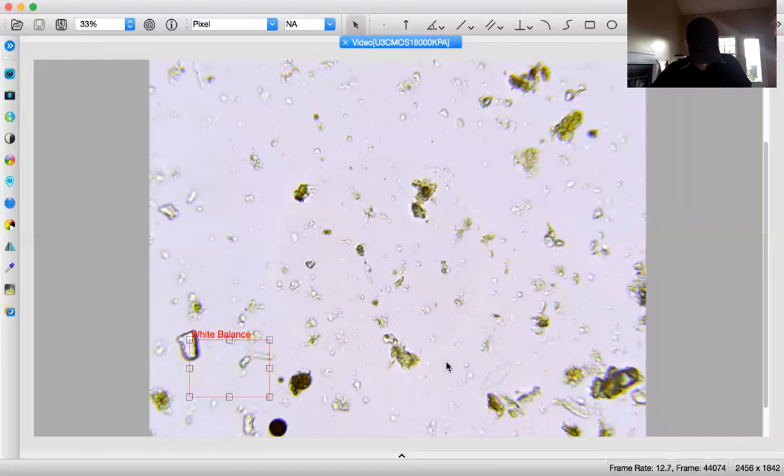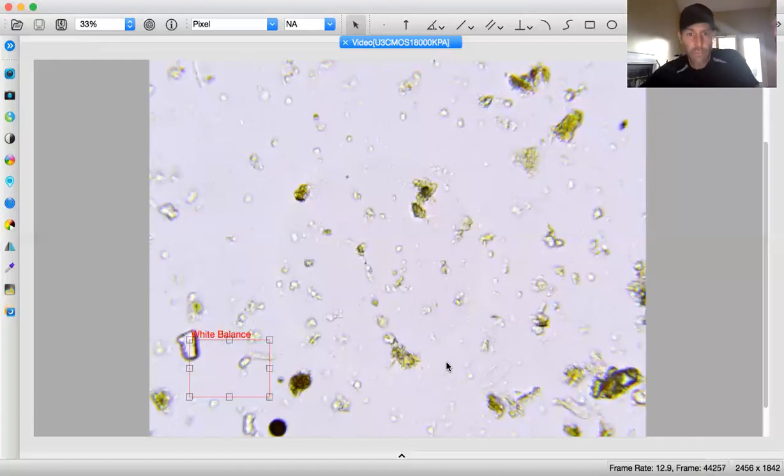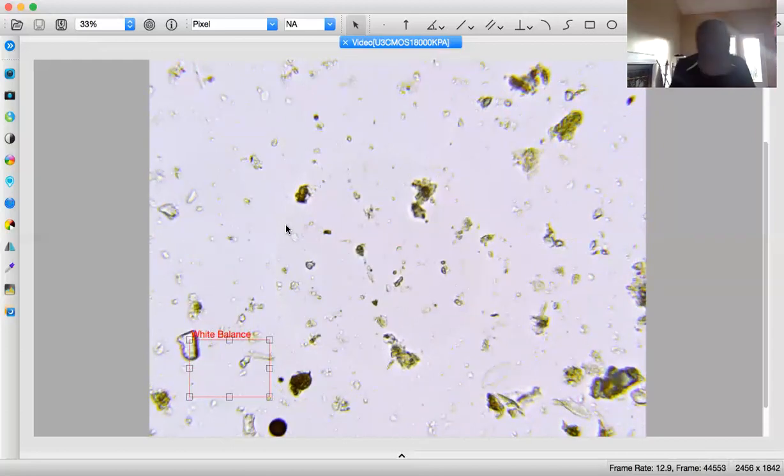So 4. Oh, flagellate. A flagellate. Flagellate right there. So one flagellate. And one testate amoeba. Oh, actually, no. There's no testate in that amoeba if it is one, so we can't count it.